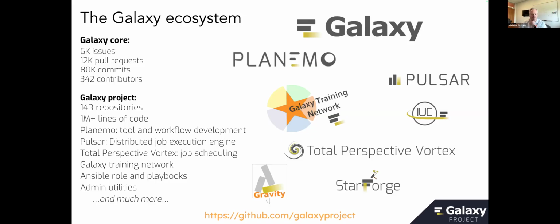If you go to github.com/galaxyproject, it's all open source, so you can see exactly how it's working and what it's doing. One thing that is pretty common is people will get started with the public server at usegalaxy.org. But if there are special tools, or you have access to a lot of computing locally and you just want to tap into that, one thing you might want to consider is setting up your own Galaxy server on your own computers. And sometimes that's convenient if you want to hook it into your own data center, or there are special data sets that you want to process.